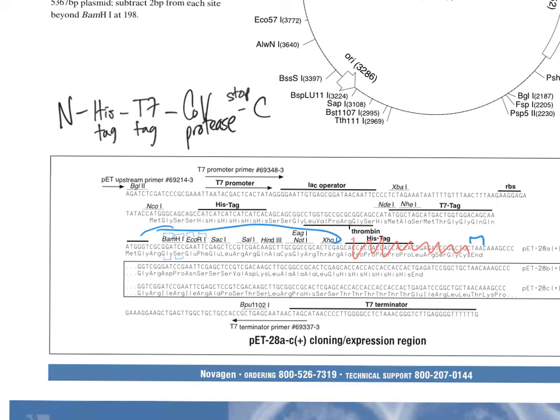If you can make primers that would do that, again, where are your primers to? Remember, the majority of your primer, you're not subcloning anything out of this. You're going into this. You are going to cut this plasmid, say BamH1 HindIII. I'm making this up, but BamH1 HindIII, you're going to cut this part out.